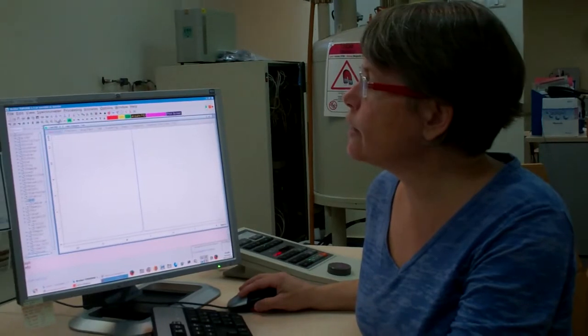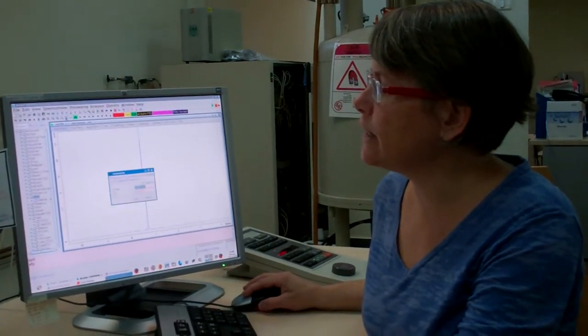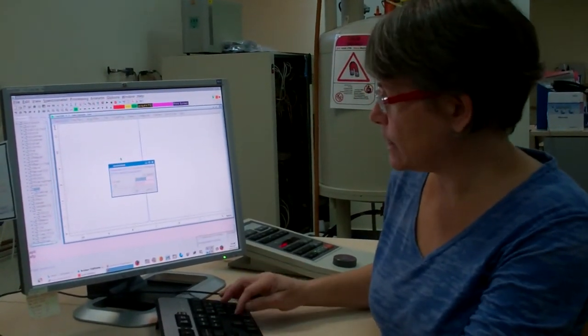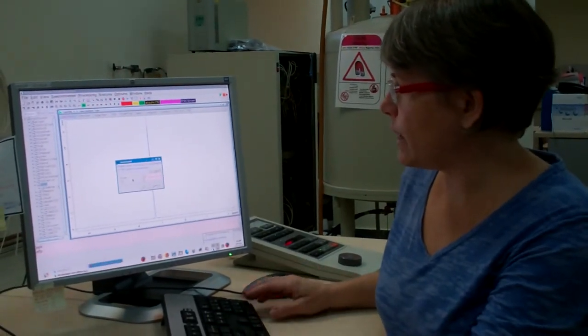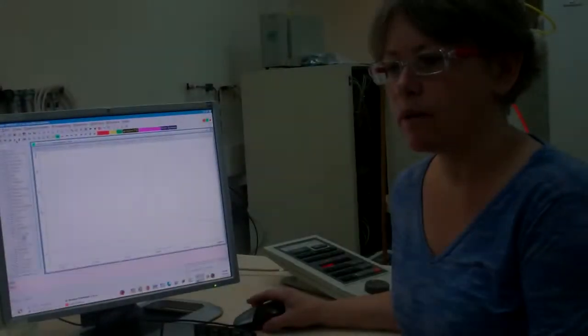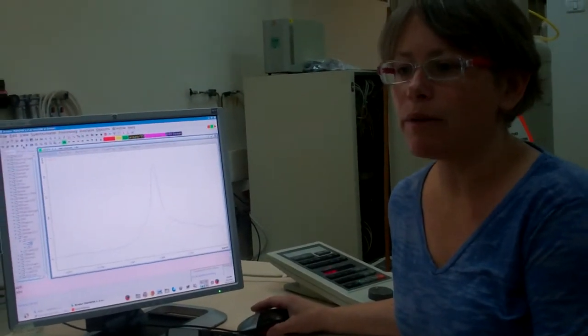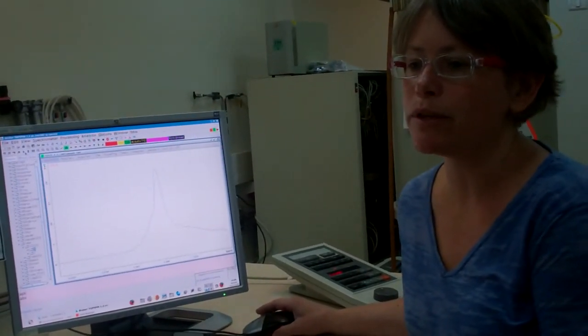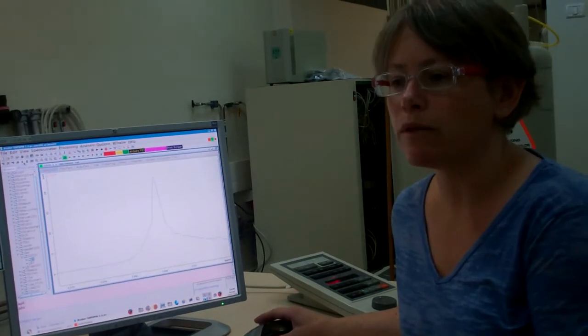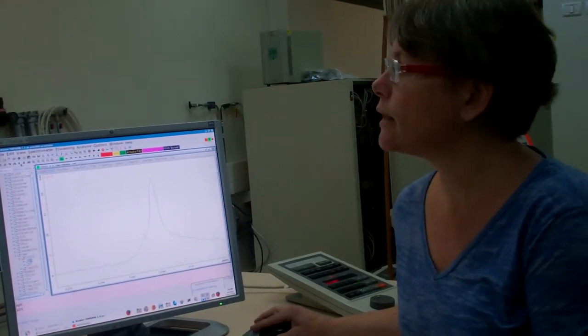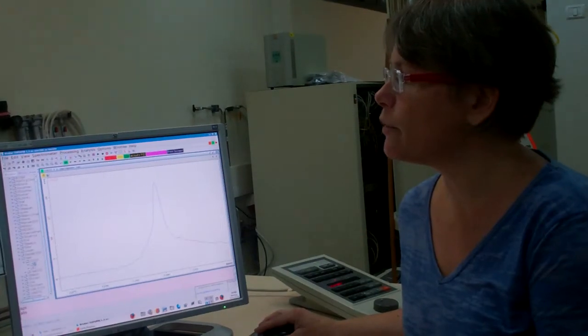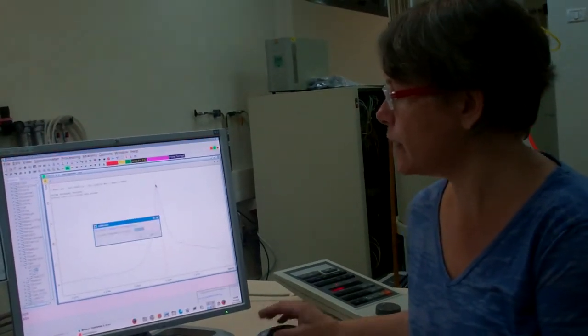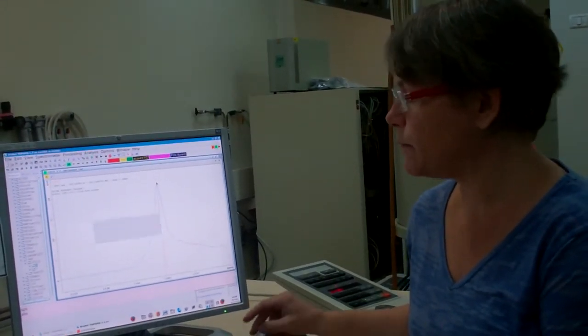And here we have a magnifying glass with an E, which is an exact zoom, say from 10 to 0 ppm. Okay. We're on calibration. I'll calibrate the chloroform signal to 7.26 ppm according to one of the literature values. I click on the calibration icon. I'm in calibration mode. I click on the peak. 7.26 ppm.